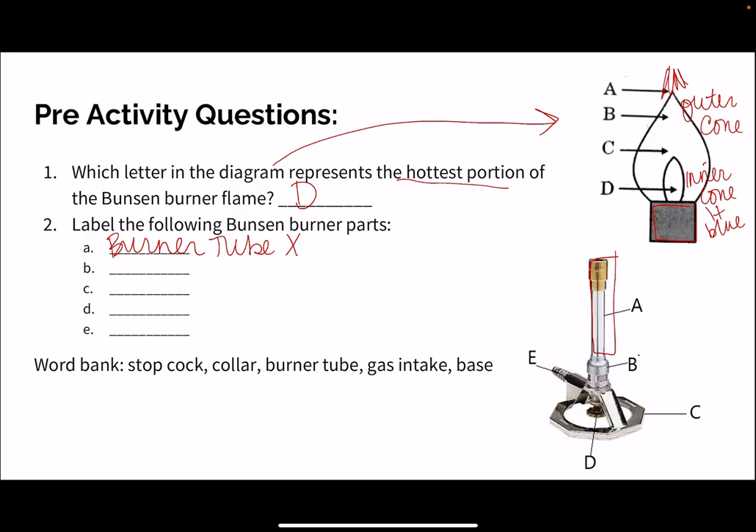B is going to be our collar, and we're going to see this is our air intake. If we open it up and we see an opening, we're going to be adding more air in, and it's going to have more of that blue inner cone. If we close it up, it's going to have more of that combustion flame of the yellows and red.